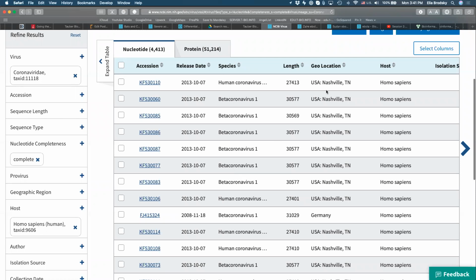And if you want to have a representative, for example, from the SARS-1 or the SARS-2, the novel coronavirus samples, you also want to organize them in groups that will not have any additional variation that you don't want to interfere with your analysis. So if your question is, how can I identify differences between these different types of viruses, you would want to look at, for example, 10 samples from China, 10 of novel coronavirus, 10 samples of SARS-1 also could be from China, right? So if you want to limit it to the variation within one country, that will eliminate some additional potential biases that could be introduced in the analysis.